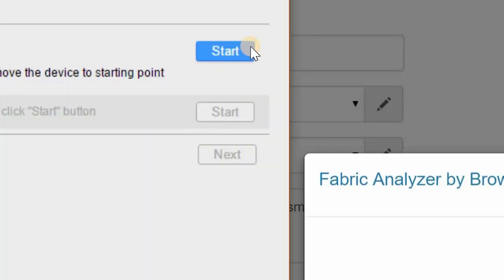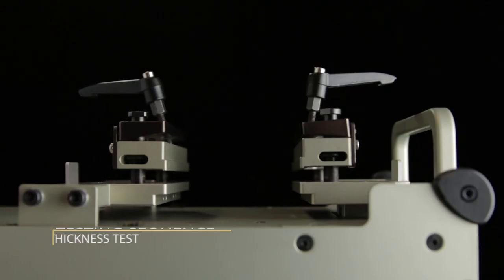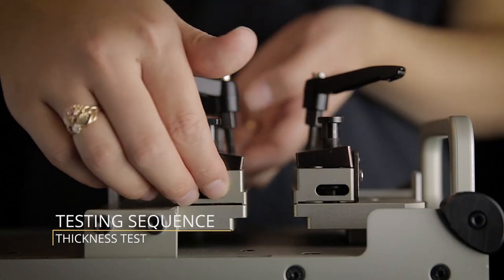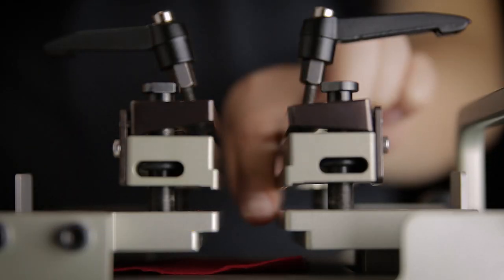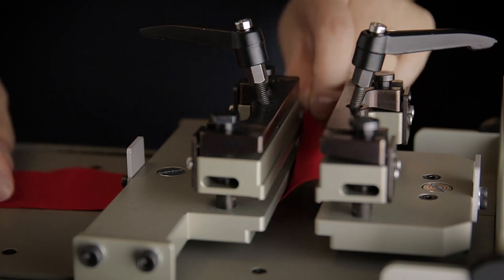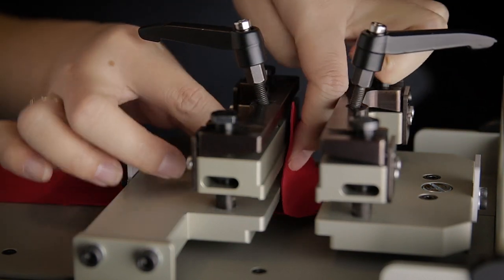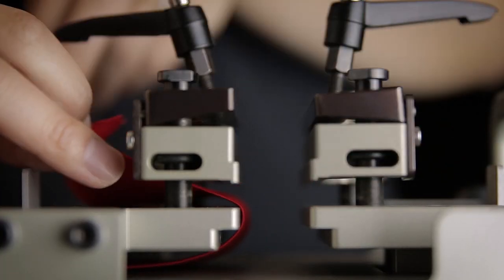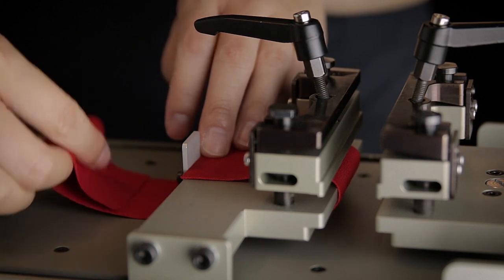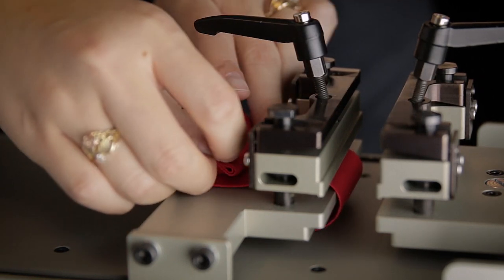First, hit the Start button to get the movable arm into the correct position for testing. Lift the clamp, slide the fabric underneath the movable arm, then wrap the fabric around the movable arm and underneath the clamp. Make sure to fold the excess onto the movable arm so it is not touching the base plate.